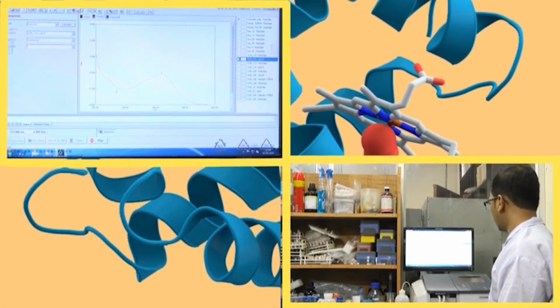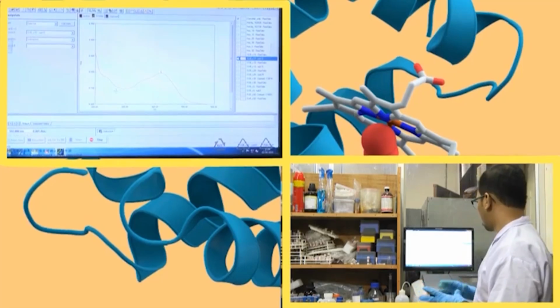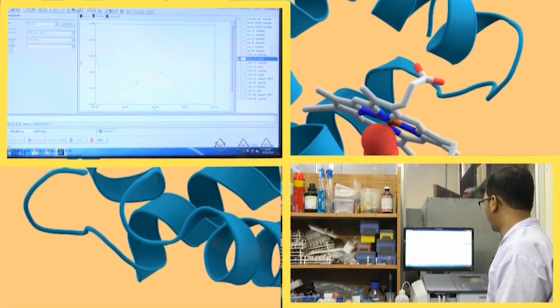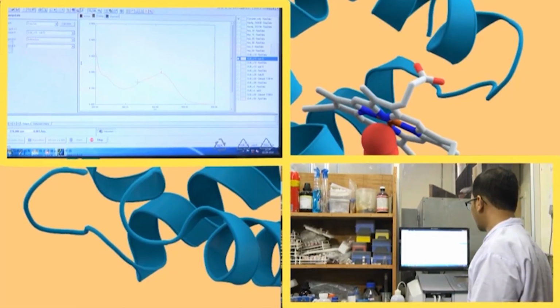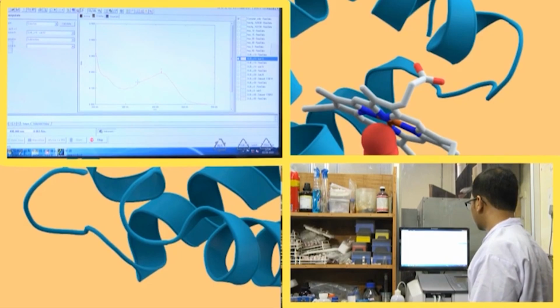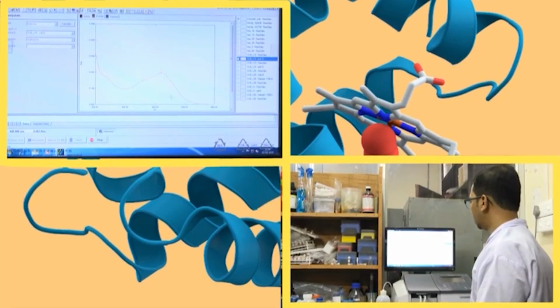So, gallic acid should have a separate spectra. Now, this spectra is for curcumin. I have kept it for a reference. So, it is already 476, so no notable changes in this region.